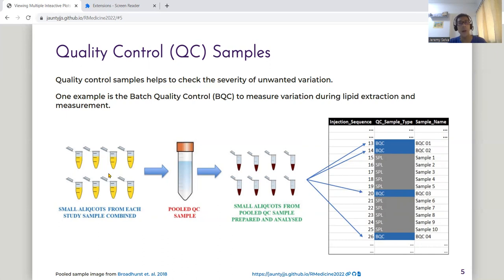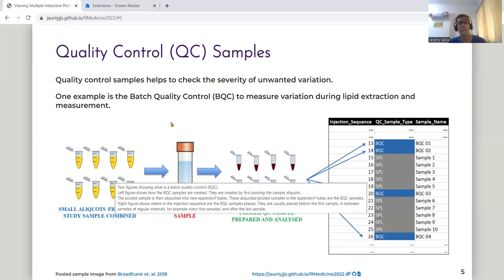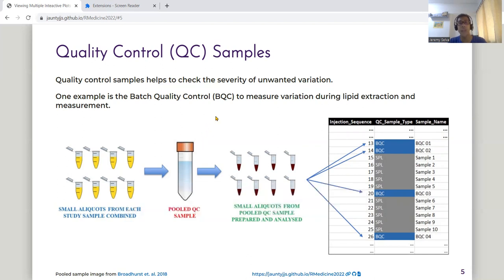It is created by creating small aliquots of study samples and pooling them together. The pooled samples are then re-allocated back into new eppendorf tubes.